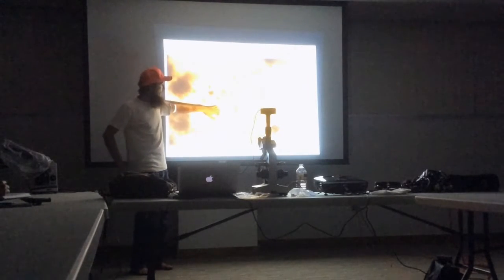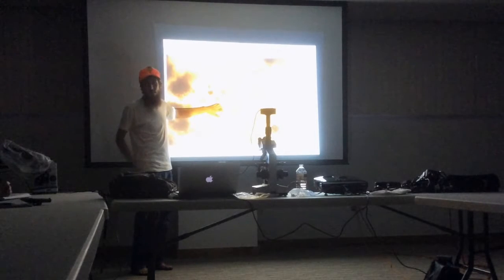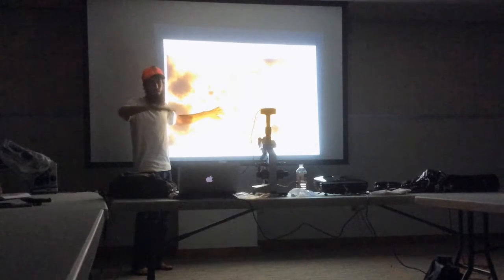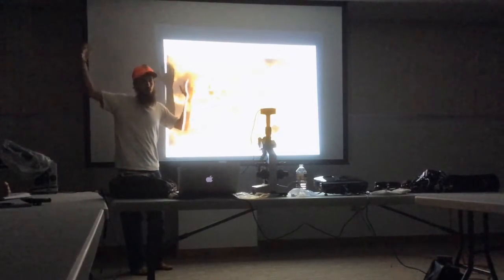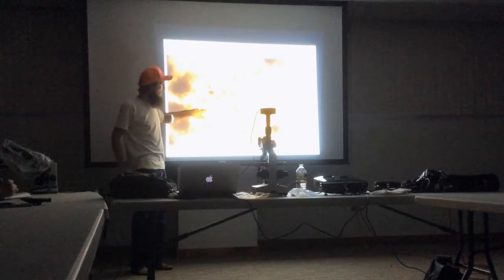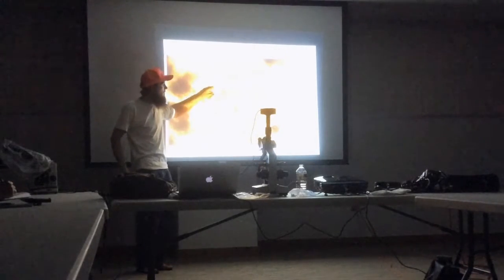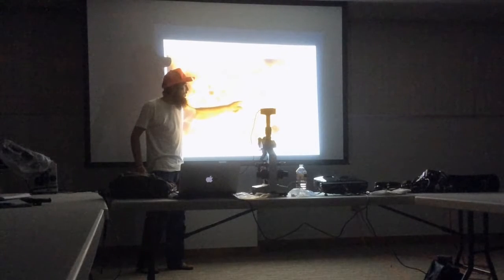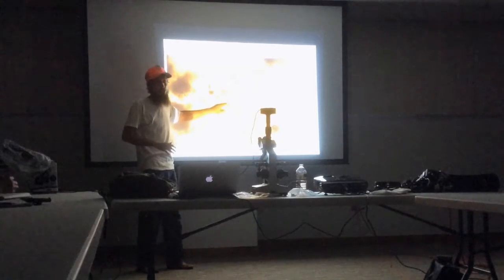So on here you might see all these tiny little things and think there's a lot of life and I have a lot of active bacteria. But really what you're seeing is just the water and the slide, and because the fan's on the table, it's making it vibrate. It's Brownian motion is what they call it. So these are not active and moving, even though they look like they're jiggling around. To see an active and moving one, it wouldn't be just jiggling, it would move with intent. Like you'd see it move down and then across, on a pattern, not just jiggling. These are jiggling.